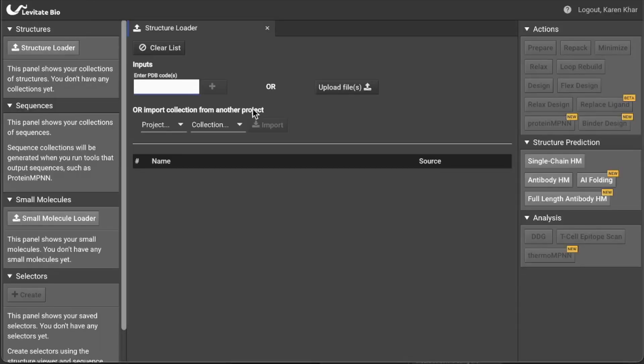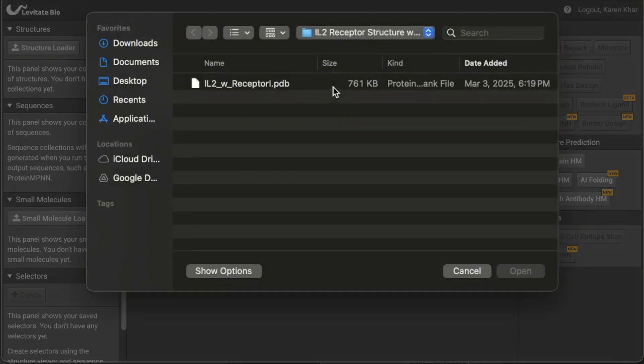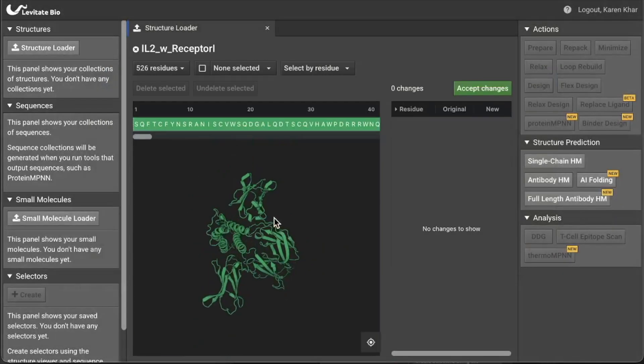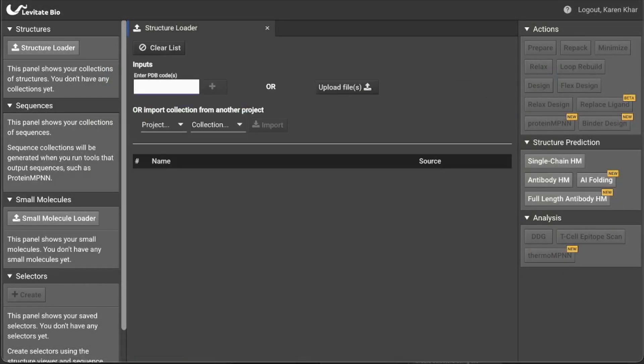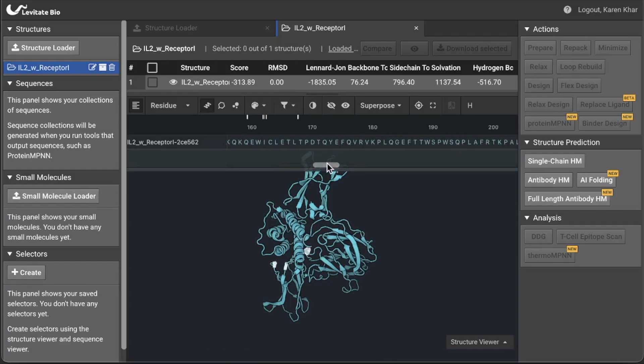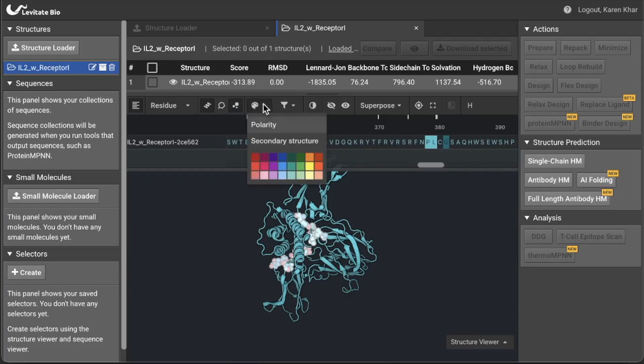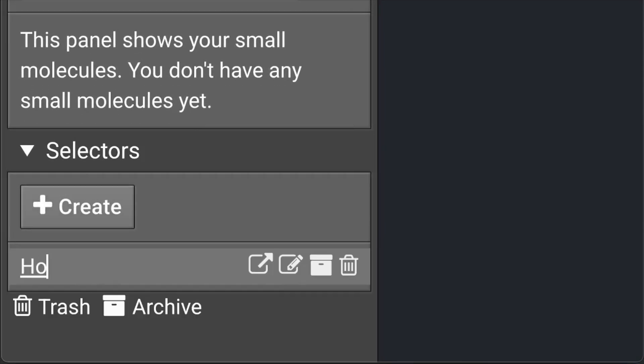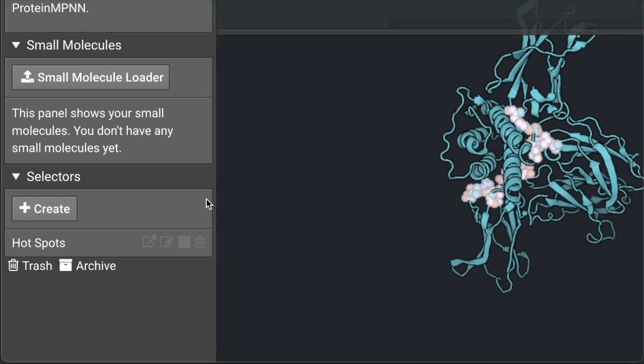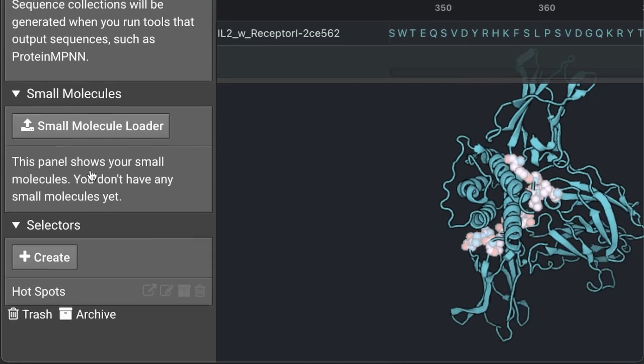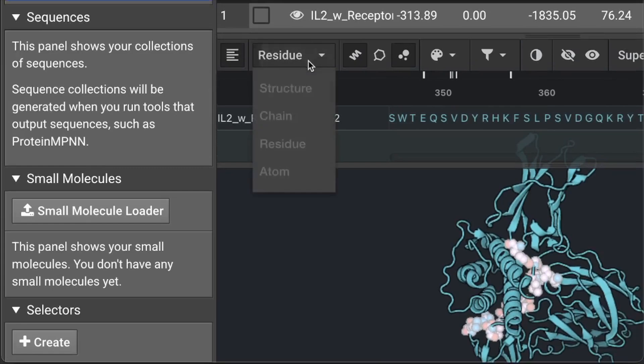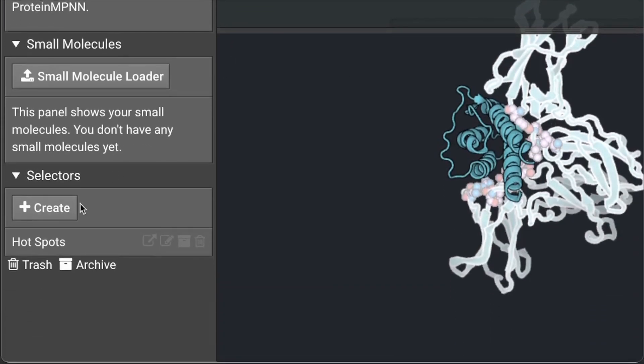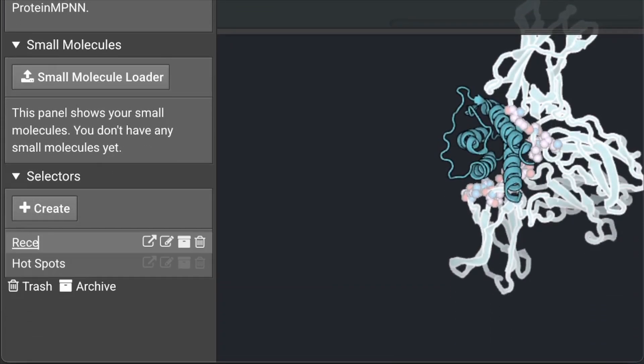Now let's walk through the workflow. Prepare for the binder design by either loading a protein target or generating a structure prediction of the protein target. Then we define the hotspots on the target where we want the binder to interact by selecting the hotspot residues and creating a selector which will save the positions. Also create a selector for the target domain or subdomain.